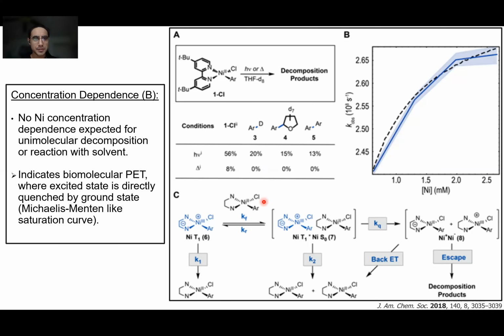And so here, in panel C, you start with your triplet excited state of this nickel aryl halide complex. There's a couple of different pathways.